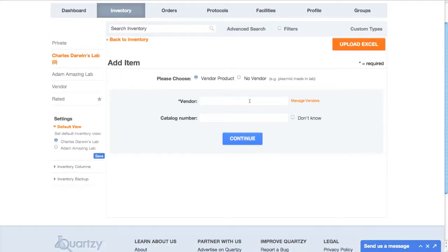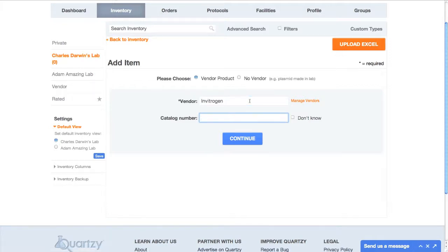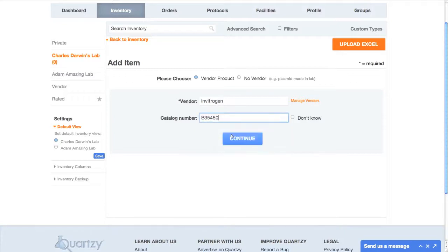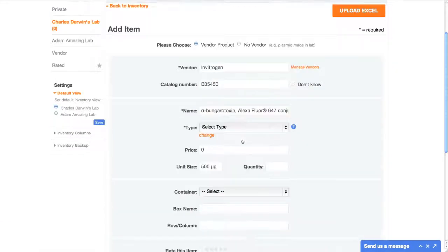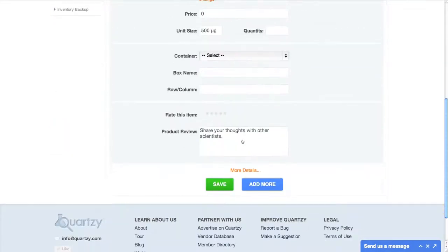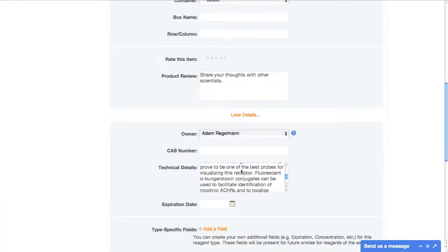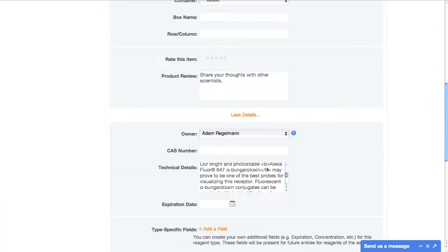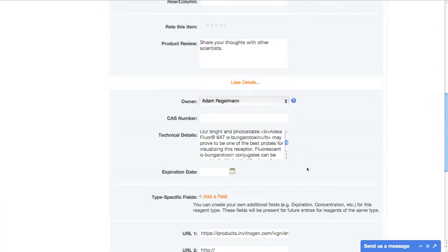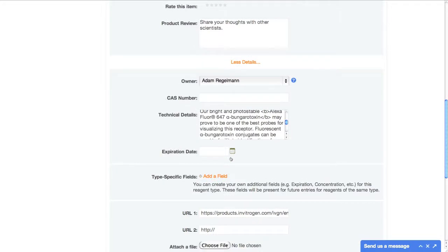First, we host catalogs from vendors, so if you're adding an item from one of their catalogs, all you need to do is enter the vendor name and catalog number and everything else will auto-populate. I simply select a type and click More Details, and I can see that all the technical information has been pulled in from the Invitrogen catalog.